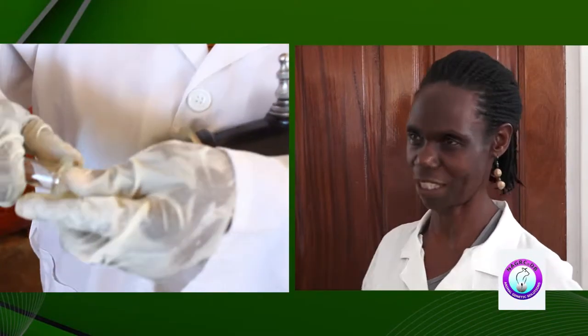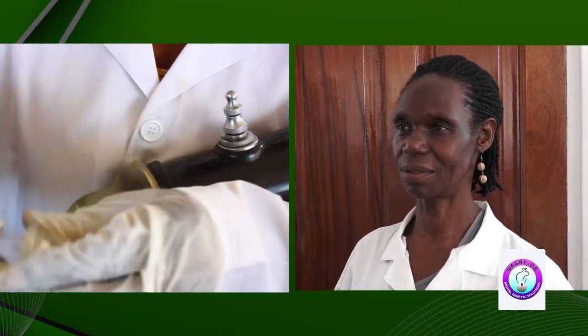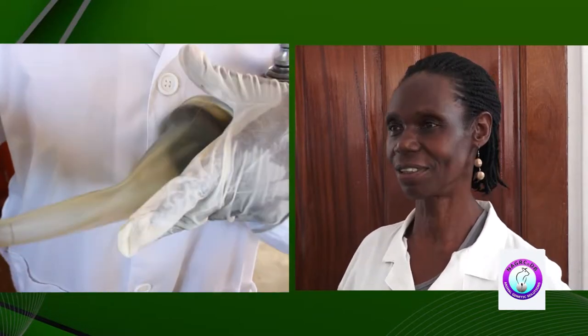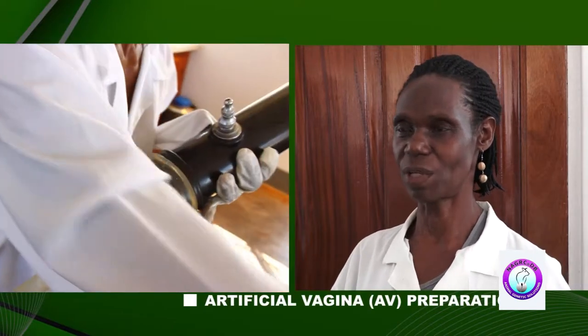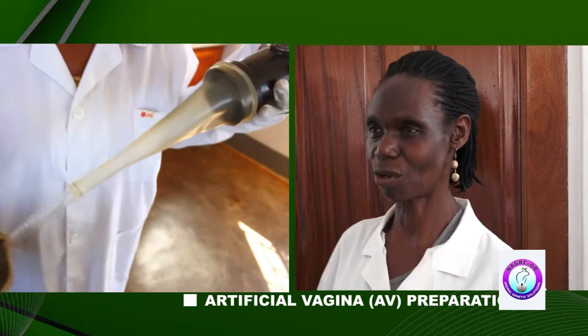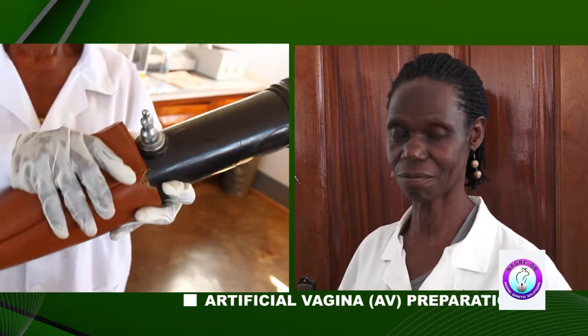My name is Elizabeth Bikaba. I work here as a senior laboratory technician. Here in the lab, we do many things, but now I'm talking about preparation for semen collection. We prepare AV. AV means artificial vagina. It's made of hard rubber, then liner, then cone, and then at the end we put a tube, after which we cover with a jacket because we don't want our semen to be destroyed by the sun rays.